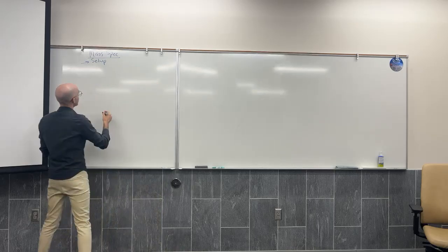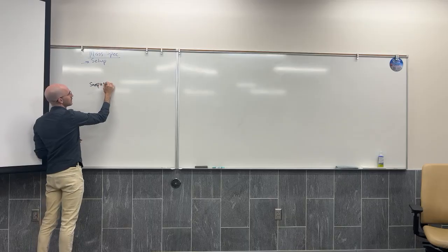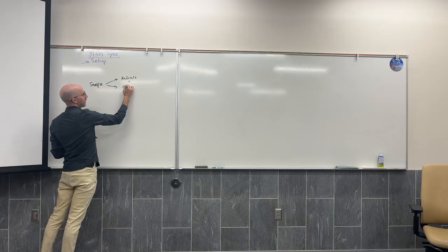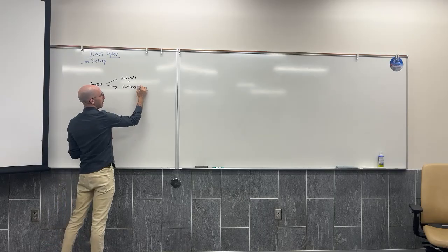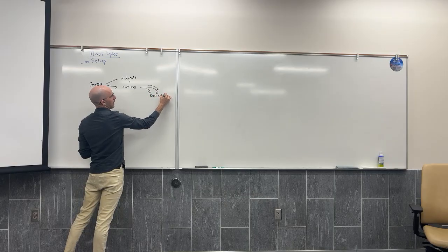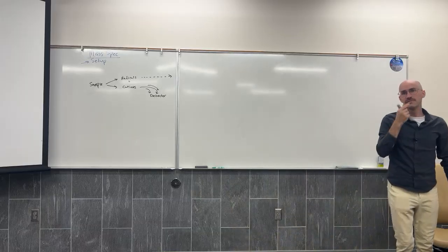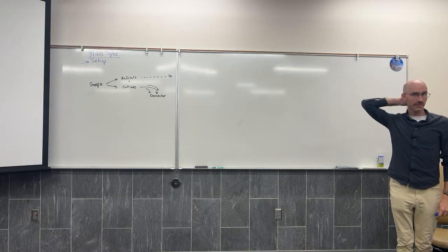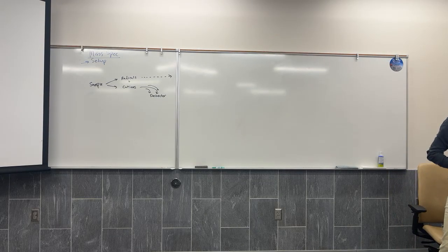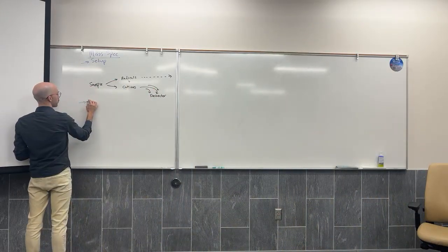Because remember, that's what we said yesterday, a sample comes in and is ionized and forms radicals and cations. The cations are then directed by a magnetic field where they hit a detector, and radicals are unaffected by the magnetic field, and the radicals are just sucked into the waste. So that was our setup. And what we're going to look at today is the spectrum. What is produced?